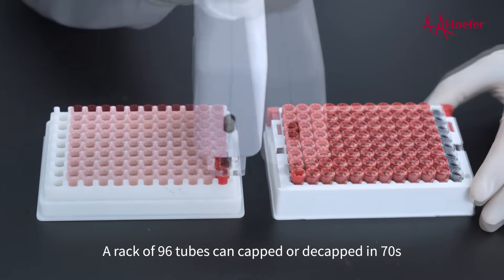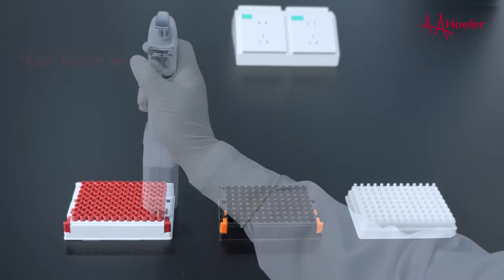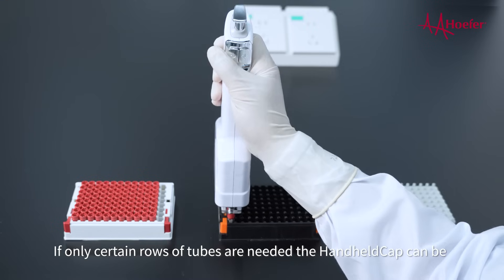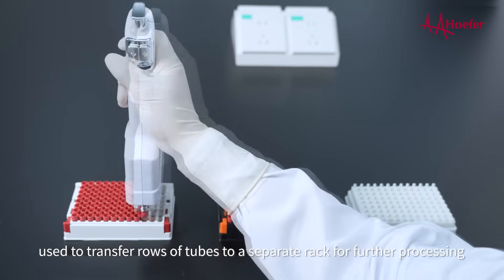A rack of 96 tubes can be capped or decapped in 70 seconds. If only certain rows of tubes are needed, the handheld cap can be used to transfer rows of tubes to a separate rack for further processing.